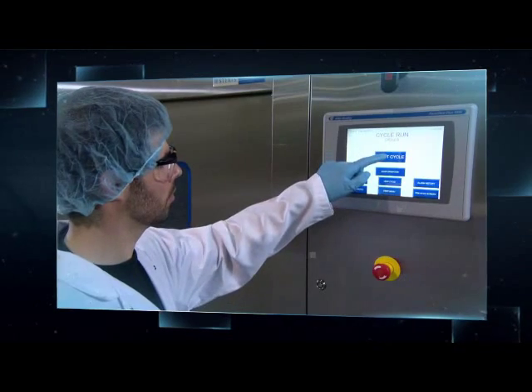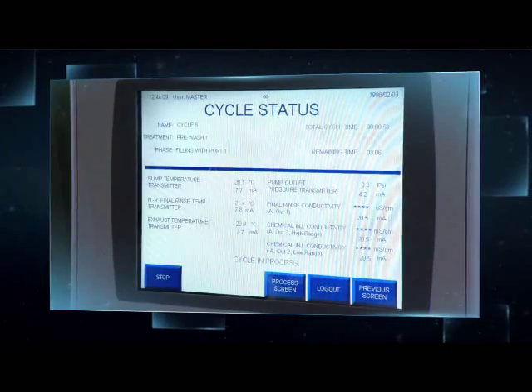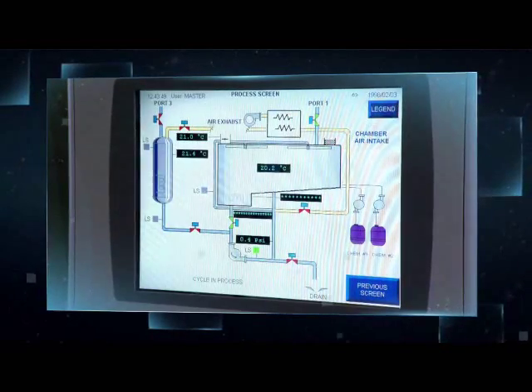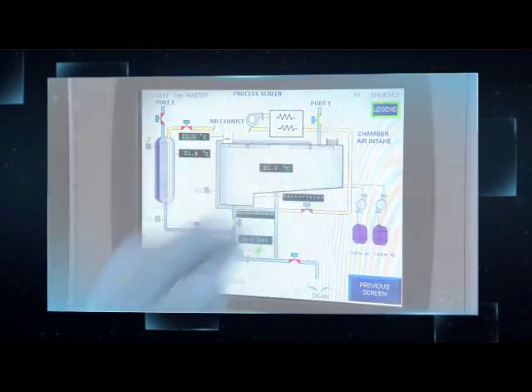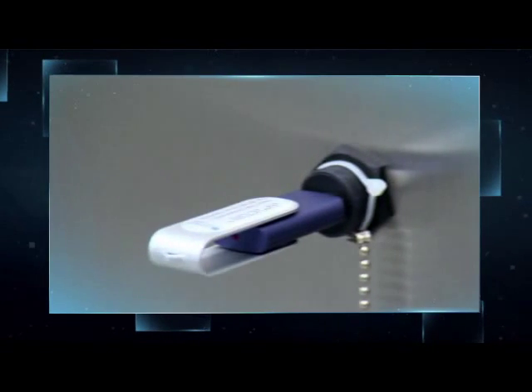The Steris PG series of washers were designed to constantly monitor all critical washing parameters, making validation easier. Process documentation can be recorded on an integrated printer or downloaded to an external computer.